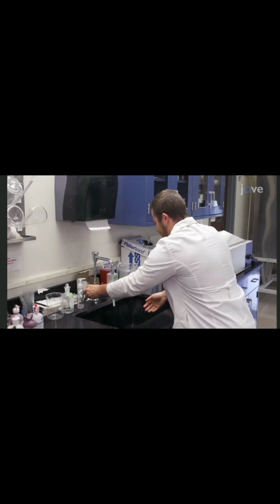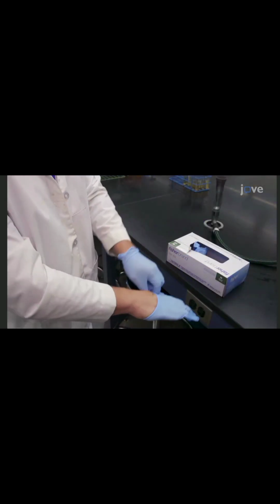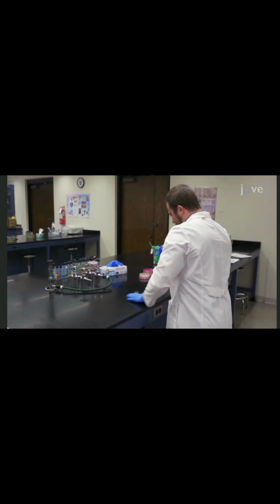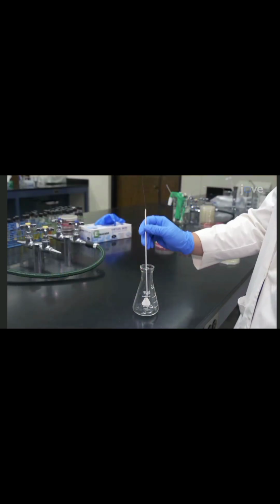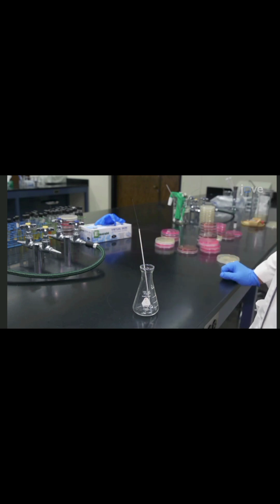Before beginning the experiment, thoroughly wash your hands and dry them, before putting on appropriately sized laboratory gloves. Then sterilize the work surface with 5% bleach, wiping it down thoroughly. Next, take a sterile inoculating loop and place it handle down into an empty 125 milliliter flask so that it does not touch the bench surface.